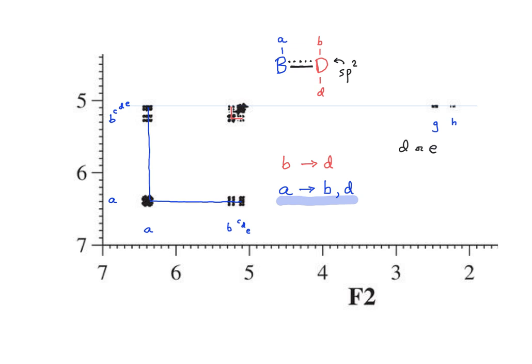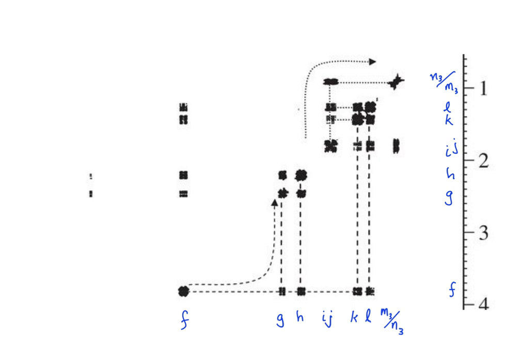There is a weak correlation between either D or E with both G and H. This is a weak correlation, so I won't make too much of it yet, but I'm reminded that protons G and H are attached to carbon G. First of all, we can see that proton F is correlated with protons G, H, K, and L. This may seem like many correlations, but then if we remember that proton F is bonded to carbon E, protons G and H are bonded to carbon G, and protons K and L are bonded to carbon F.